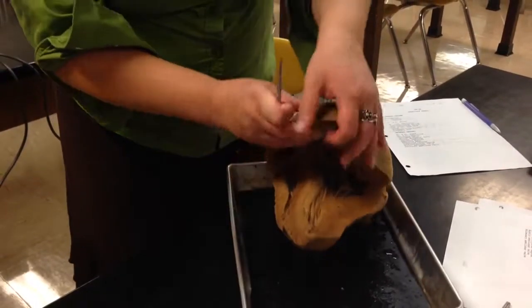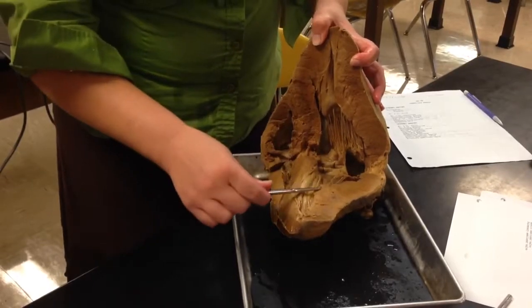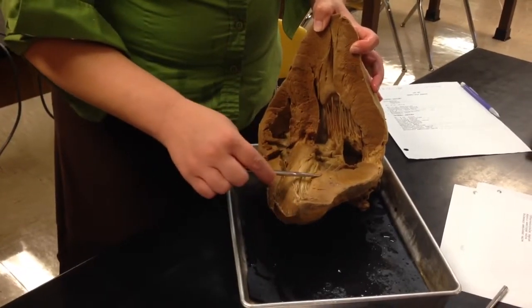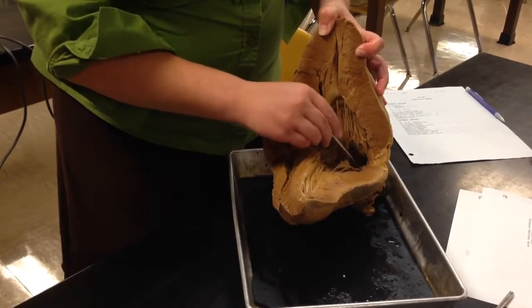If we open it up, you're going to know that this is the left side of the heart because of how thick the myocardium is. So this is a very thick myocardium. It needs to be thick so that it can pump blood all the way to your feet. So it has to have the thicker wall. So this would be left ventricle. If we go through the valve, this would be left atrium.